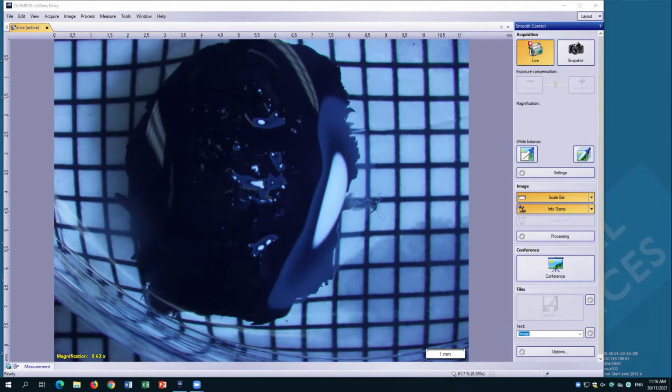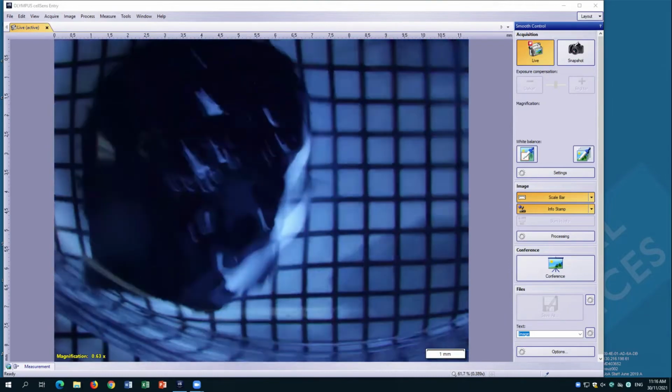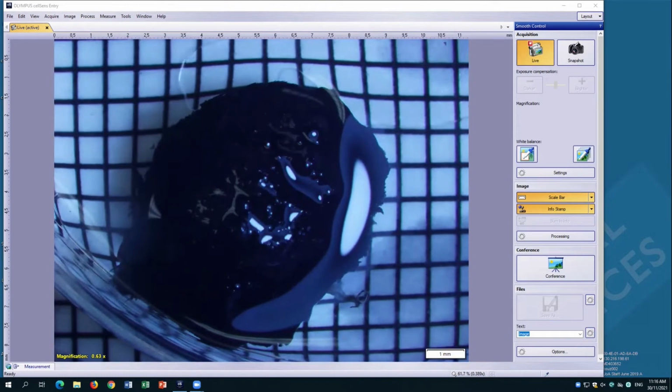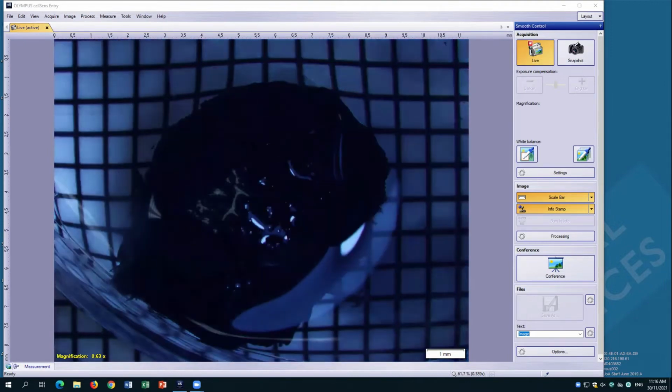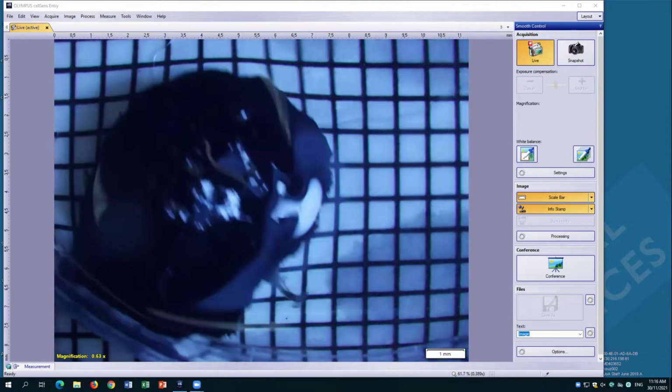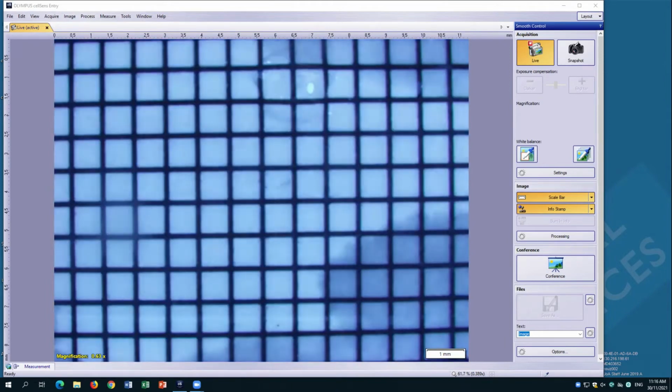Just like your chest X-ray, you primarily see the bone and you don't see much of the soft tissue. It's hard. So to help us visualize the soft tissue inside the cochlea, the typical tissue cochlea scan is done with this osmium staining, and then it gets scanned. So this is a typical sample that we've scanned to generate the cochlea data. Now, cochlea data might be something that you, Senorita, and Brace may also be working on, to get some of the features from human cochlea and sheep cochlea, because we're going to use that information to build a model system to do a few experiments around drug delivery. So this would be similar material that's generated data you could be working on.